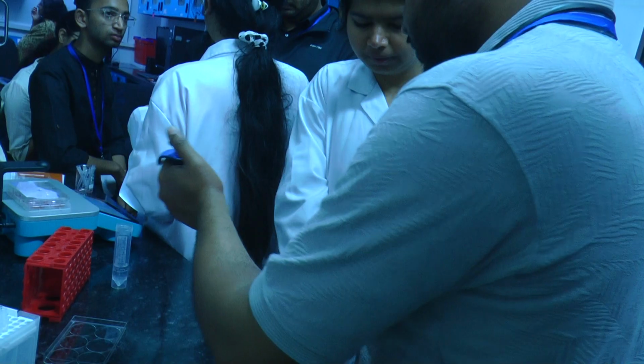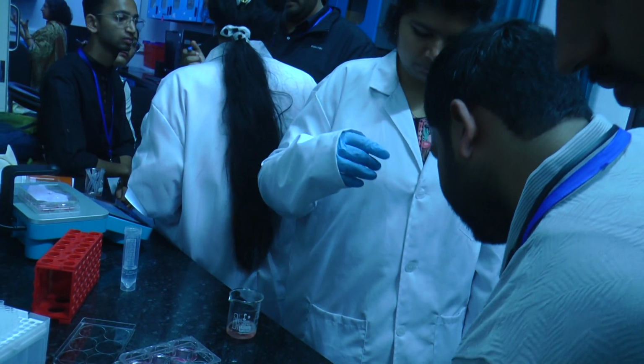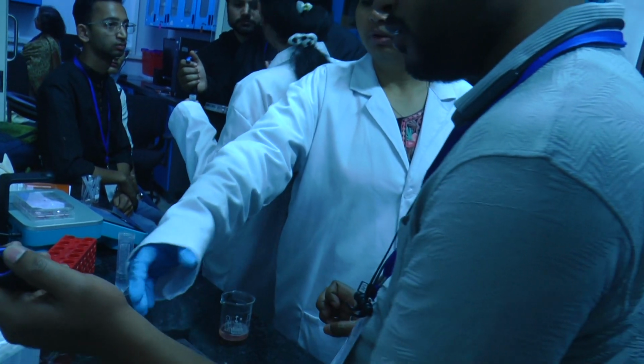Like for the bigger one I add 1 ml, for this we can add 500. Okay, done? Now take it out.